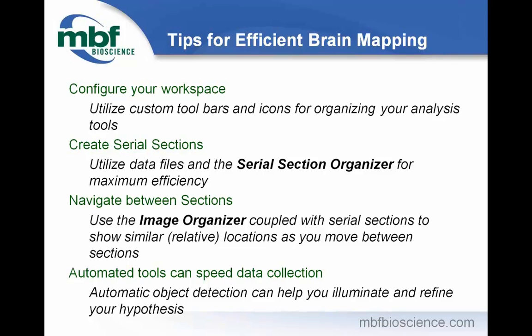And so you can create collections and share those with people you are collaborating with, or bring those images down into Neurolucida and continue to collect data from them. You could have multiple people looking at the model from different locations. Your server could be right next to you, on a local area network, or in Chicago. Okay. So that's going to be a topic of another webinar coming up shortly, I think in April. So stay tuned for that.